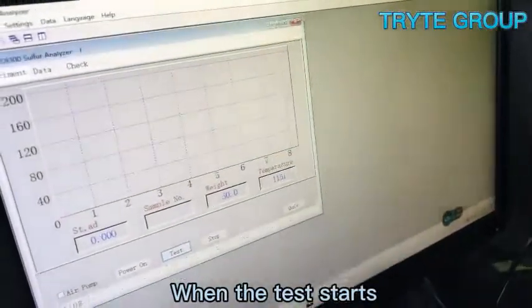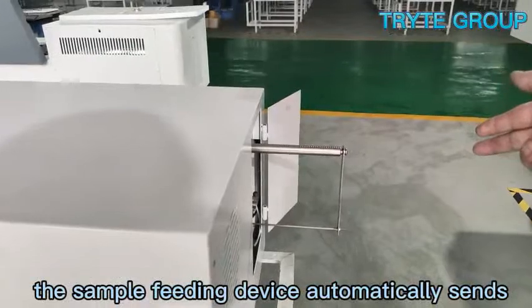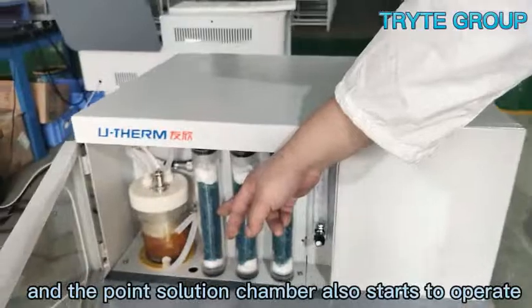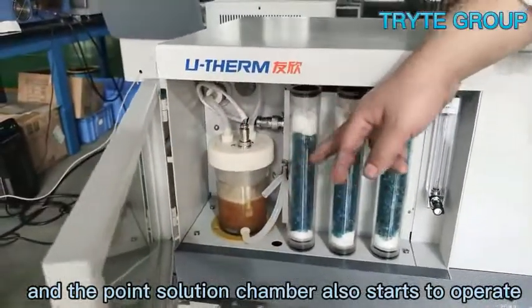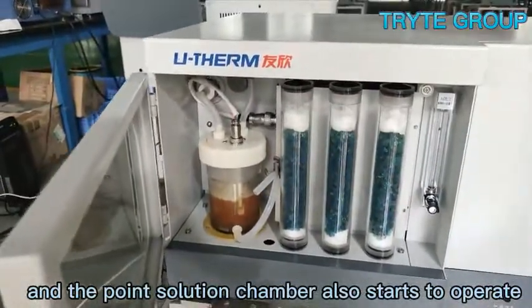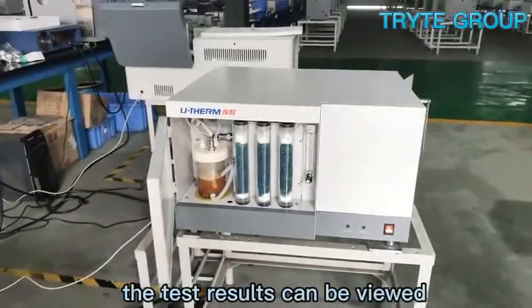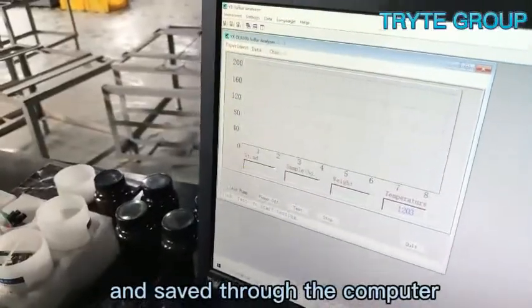When the test starts, the sample feeding device automatically sends the sample crucible into the furnace, and the electrolysis chamber also starts to operate. After the test is completed, the test results can be viewed and saved through the computer.